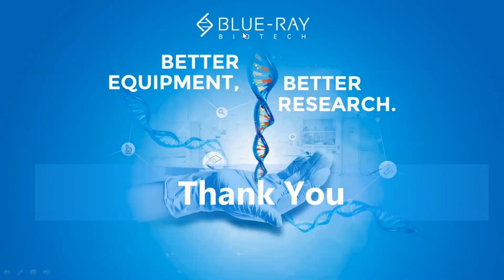We connect the live cell imaging system, which is the EzScope 101, to the computer. This computer is Windows. If you can find any remote monitor application and install it on this personal computer, you can view this. You can view the images of the cells from your laptop at home. That's okay. That can be achieved with a remote monitor application.